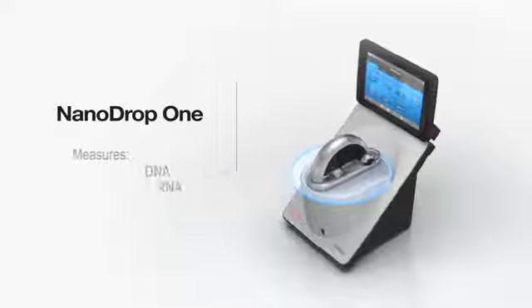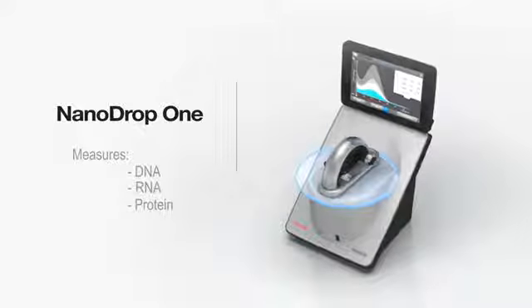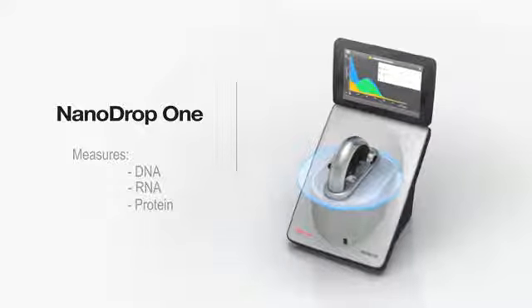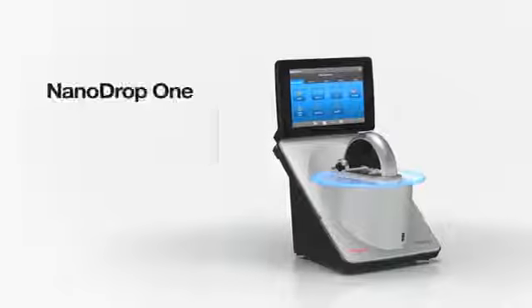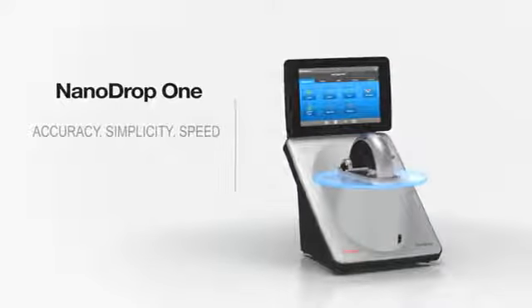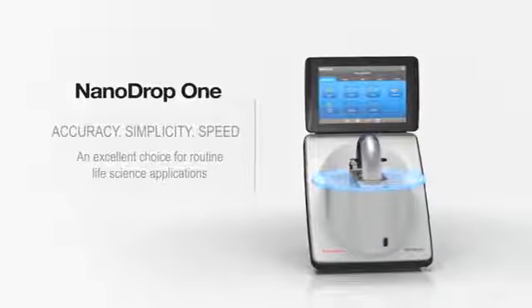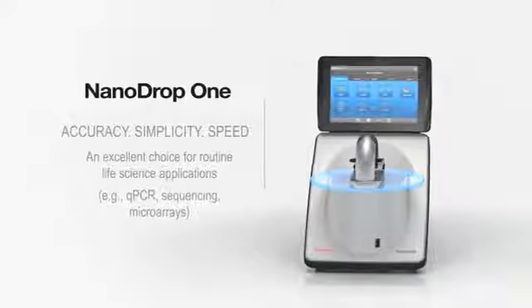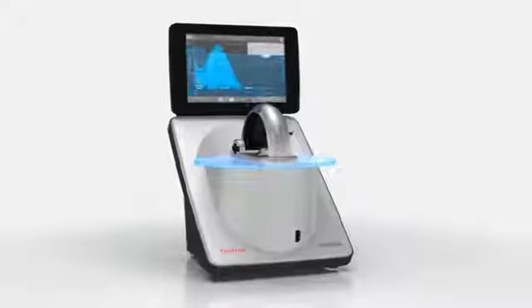Thermo Fisher Scientific also offers the NanoDrop One UV visible spectrophotometer to measure purified DNA, RNA, and protein. In contrast to the Qubit fluorometer, which requires reagents and some sample preparation, the NanoDrop instrument allows you to directly measure 1 to 2 microliters of sample with no dilution. The NanoDrop One instrument's accuracy, simplicity, and speed make it an excellent choice for the evaluation of purified DNA, RNA, and protein samples for use in many applications, such as qPCR, sequencing, microarrays, and antibody arrays.